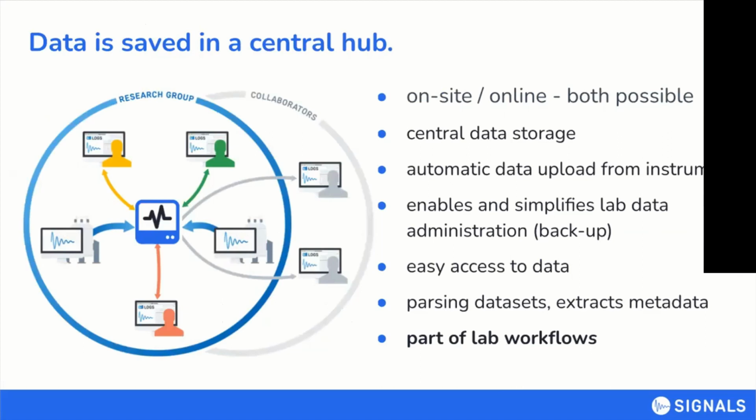This hub can be on site, which means you can install it on hardware in your lab or in your institute. You can also do so on virtual machines, or we can have it saved for you online and deliver it as a software as a service. The data is basically uploaded automatically or by hand from the lab. And this greatly simplifies, I think, the data and the primary data pickup.